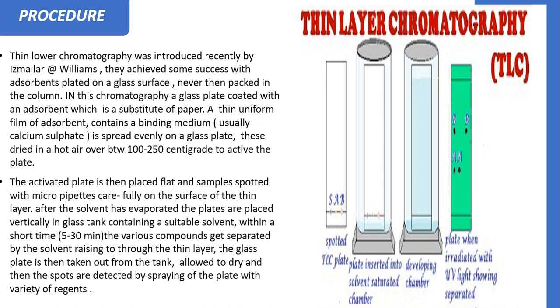Okay, or sometimes benzidine solution can also be used for the sugars, that is carbohydrates, or KMnO4, that is potassium permanganate. Or the benzidine solutions are used for the identification of carbohydrates in the chromatography technique as a spraying reagent. Then what about the amino acids? It's nothing but the ninhydrin reagent.